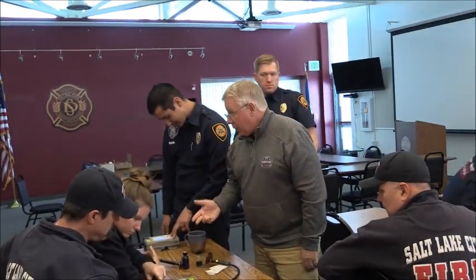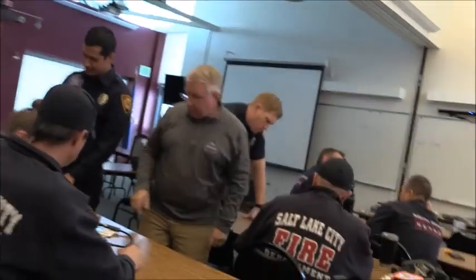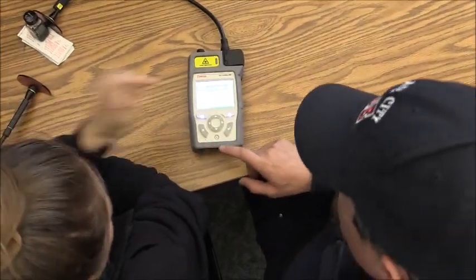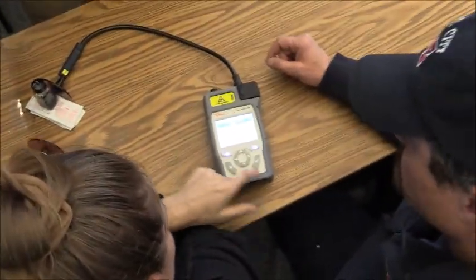When you're ready to run another scan, on the Raman, you can do it. And on the FT, you can run the Raman on this one too. All right, so you're ready to run another scan. So don't do anything yet. You've got your result. You can back out to the main screen or just press the scan key. Press this diamond button and guess where it took you? It took me to the home page in one pass.